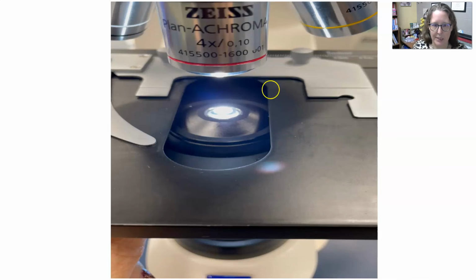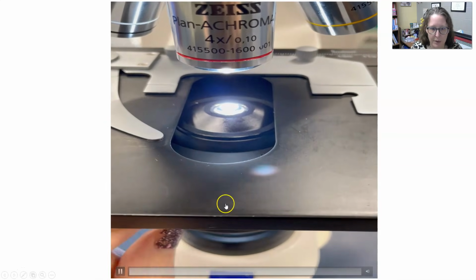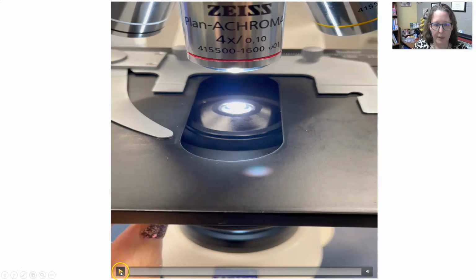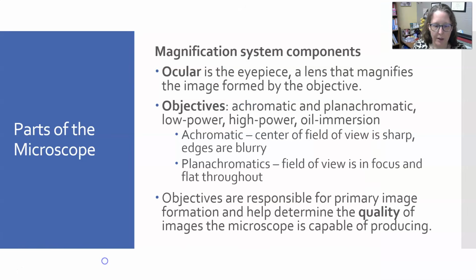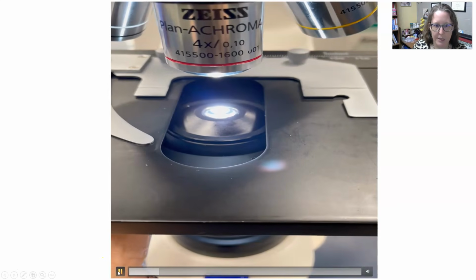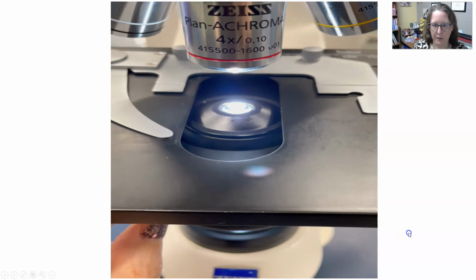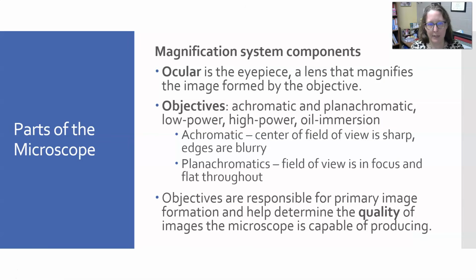And you can see it with the light on, so you can see how the light shines through the condenser, and it shines onto the objective through the slide, which there's no slide in this one. And then this is a video where I'm playing with the iris diaphragm lever in the condenser underneath the stage here. So you can see very bright to dim to very bright. So there you go.